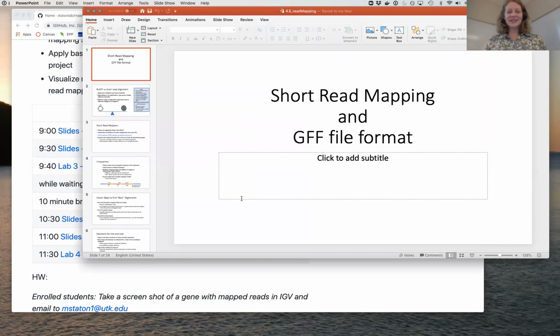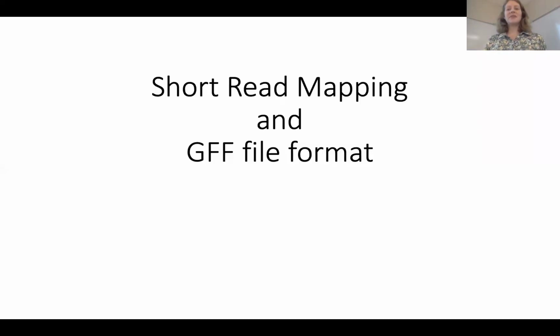Okay, so I'll start talking a little bit more about read mapping. Hopefully, get the slideshow. There they go. Okay. And I'll also talk about the GFF file format.